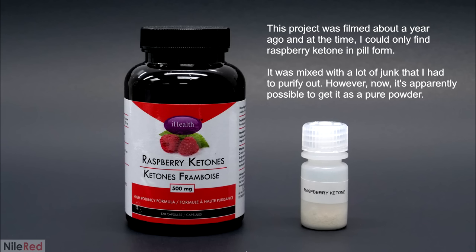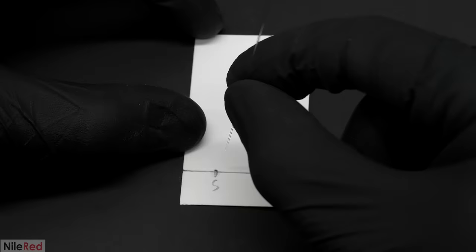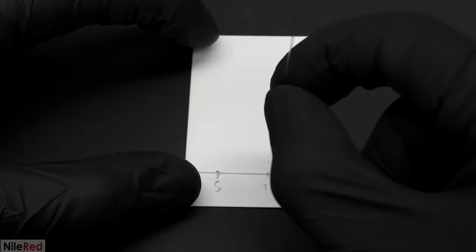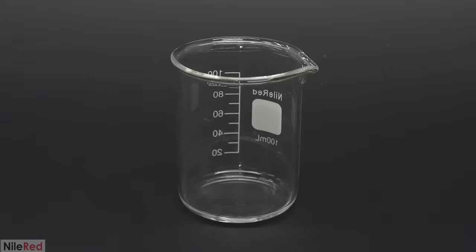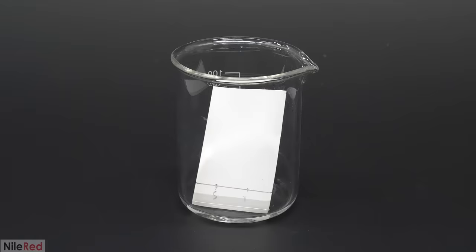To do this I first needed a reference sample which for a lot of projects can be hard or impossible but in this case it was really easy. As I mentioned in the intro pure raspberry ketone is sold online so I just had to pick some up. Then onto a TLC plate I loaded a very small sample of this along with some of the stuff that I made. This was done by dissolving each of them in a small amount of acetone and they were applied using a very thin capillary. When it was ready I put it in a beaker that was preloaded with a 50-50 mixture of hexanes and ethyl acetate.